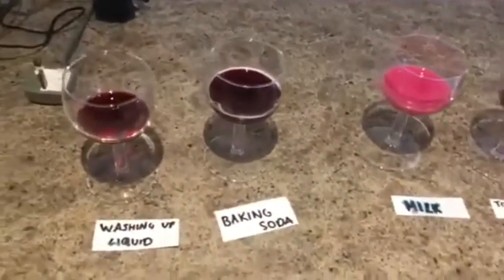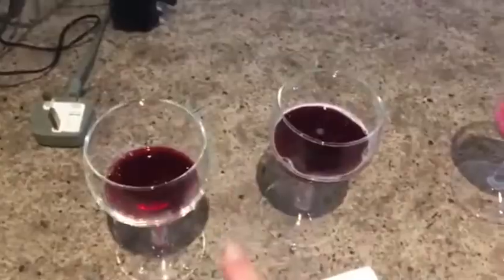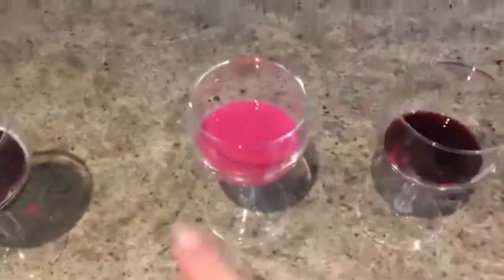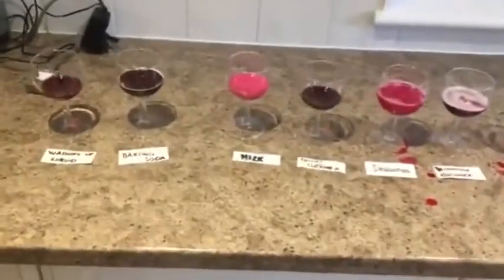We had a couple of spillages, but they're all pretty much the same colour, except these ones are much darker than the vinegar, which is very acidic, which is more pink. And again, the milk ruins it because it's off its colour. So that's the beetroot.